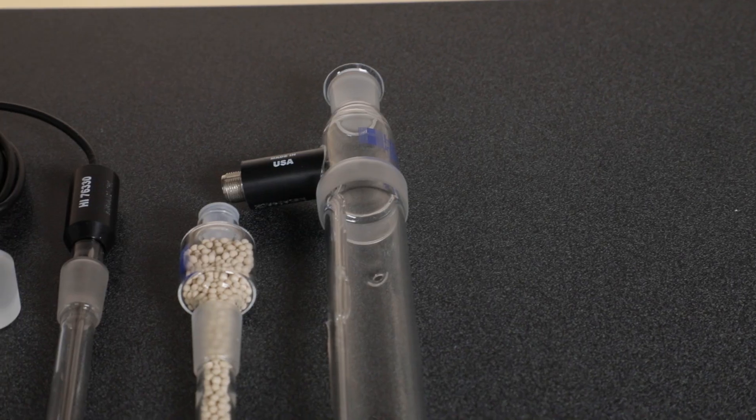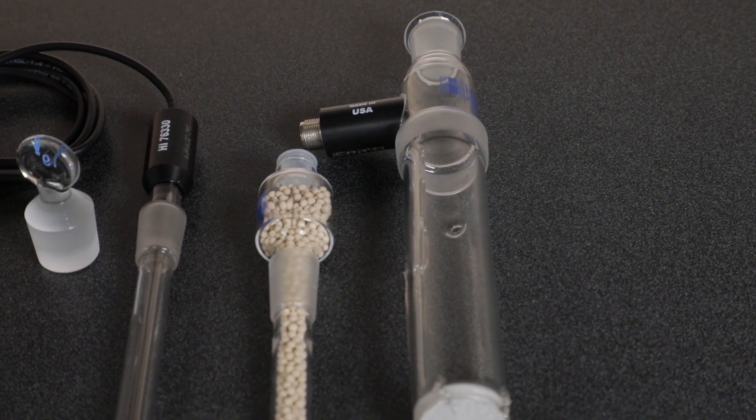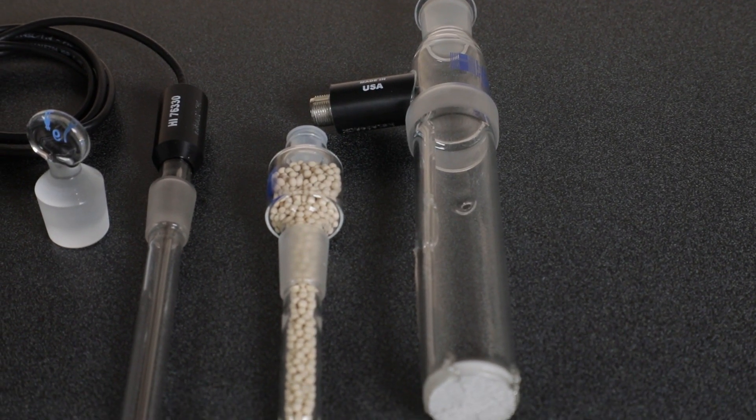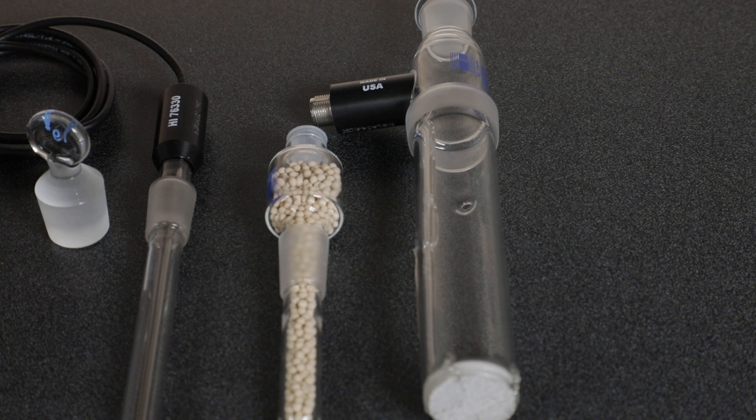Next, we'll assemble the beaker assembly and place the remaining ground glass components. For each ground glass component, make sure to apply a thin layer of silicone vacuum grease to each joint before inserting.